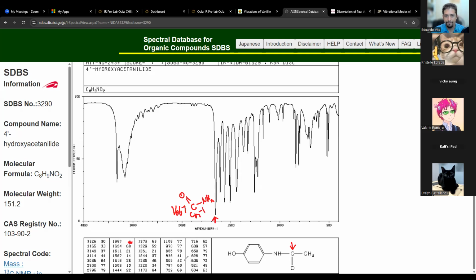You see that? And then you have this OH group that is attached directly to an aromatic ring. And remember, aromatic rings make everything sharper. So this time you go over here to this signal, and even though it's not the same usual shape as an alcohol, it's still in the same region, and your structure is telling you that it's there. And you know you have an aromatic ring. Aromatic rings make all the signals sharper. So it just happens that this really broad signal got really, really sharpened by that aromatic ring. But this peak is still an OH peak.